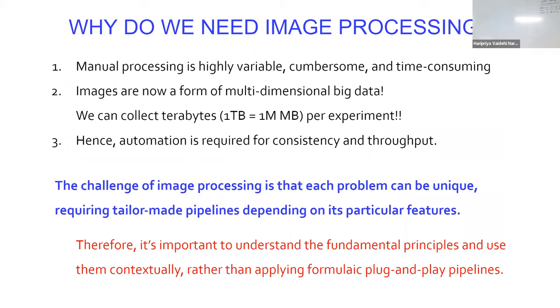I'm going to formalize these things here: yes, it's totally variable, it's cumbersome, it's time consuming. And I'm running a microscopy experiment right now down the hallway that is generating 600 gigabytes of data. Do I want to go through that by hand? I think not. It's a big data problem. And at this point, when we do microscopy experiments, you're expected to think of these things as big data problems. Therefore, you require automation for consistency and throughput, to go through everything well and take it forward for good applications where you can do fancy things with the data and so on.